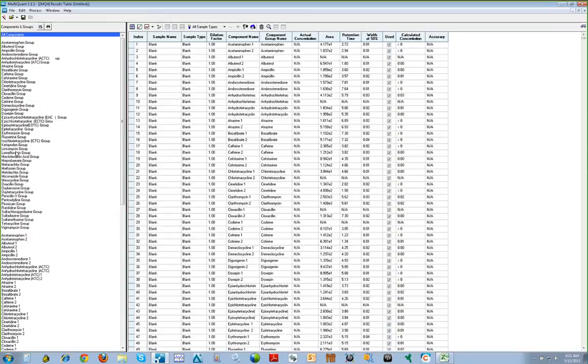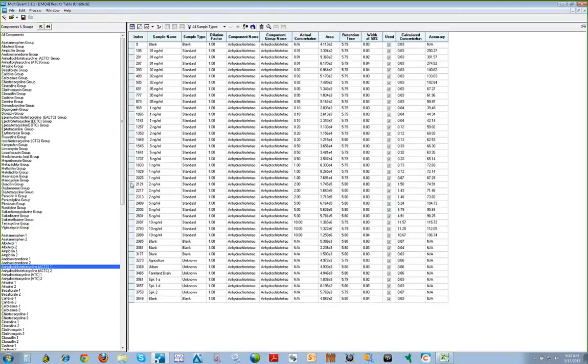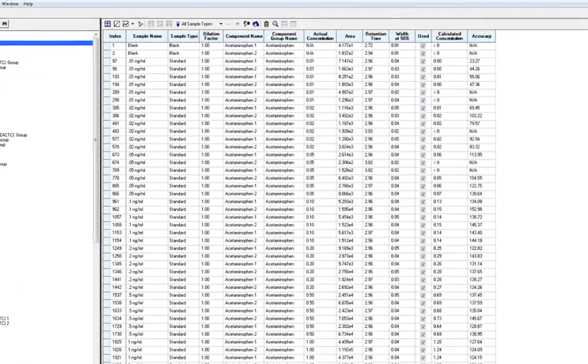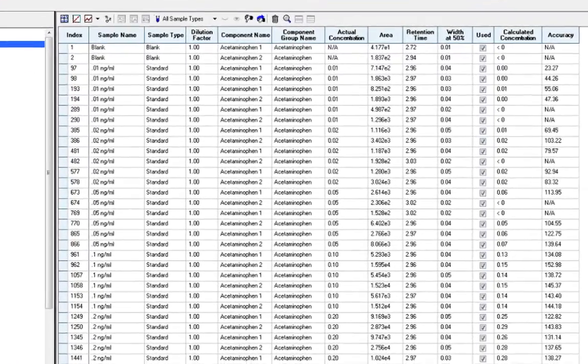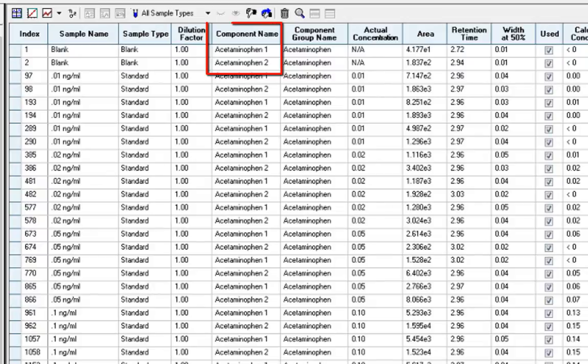We have our method here set up to display groups where each compound has its unique group that contains both MRM transitions that we are monitoring for that compound. By clicking on any compound, the table will automatically update with the results for the entire batch for that specific compound, and the same if a group is selected. Here you can see for our group, we are able to see both the quantifying and qualifying MRM transitions for that compound.